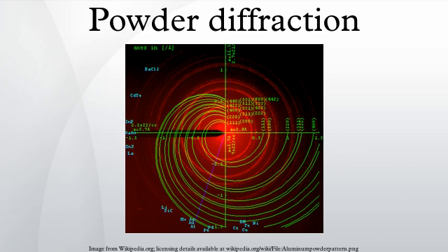It is possible to separate these by combining the two equations in what is known as the Hall-Williamson method. Thus, when we plot one quantity versus the other, we get a straight line with slope and intercept. The expression is a combination of the Scherrer equation for size broadening and the Stokes and Wilson expression for strain broadening. The value of ε is the strain in the crystallites, and the value of D represents the size of the crystallites. The constant K is typically close to unity and ranges from 0.8 to 1.39.